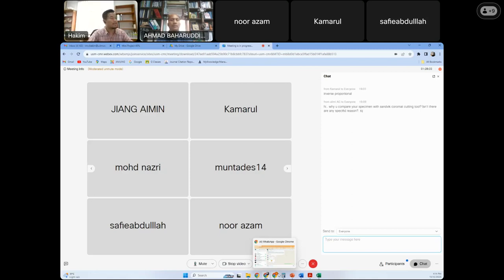But when I was doing the XRD experiment, I found that this Kennametal tool is silicon nitride based. So it's not fair, because silicon nitride is far better than alumina based material. So this time I was careful, and I found the Sandvik Coromant tool is alumina based material. So I take this Sandvik Coromant tool.